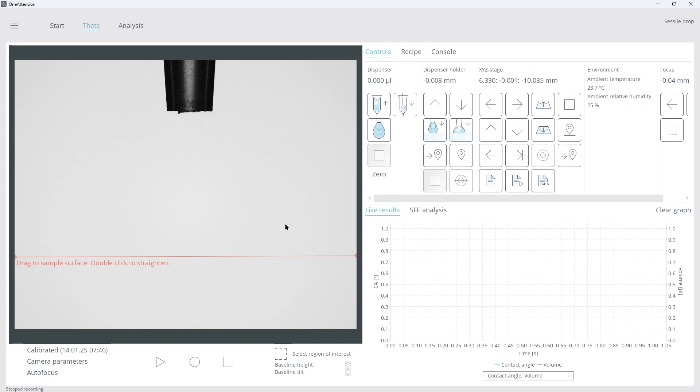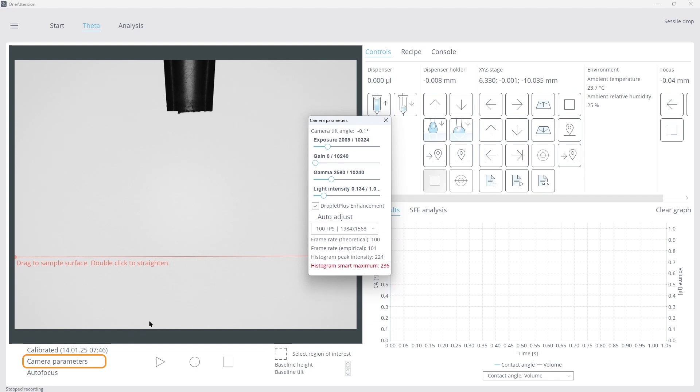For a consistent image, click Camera Parameters, select Auto Adjust, and close that window.